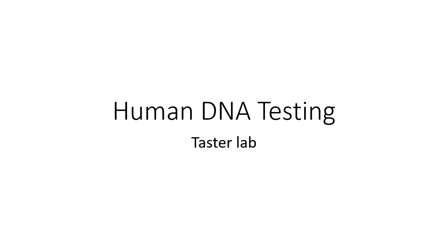Welcome to our human DNA testing lab explanation. This is a fun lab and I really hope it works for everybody.